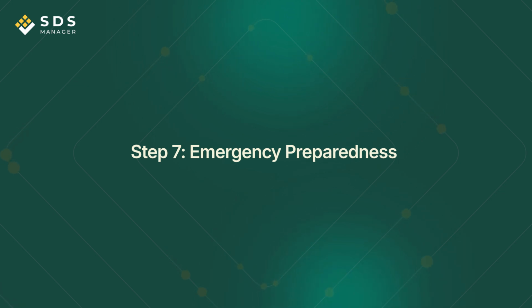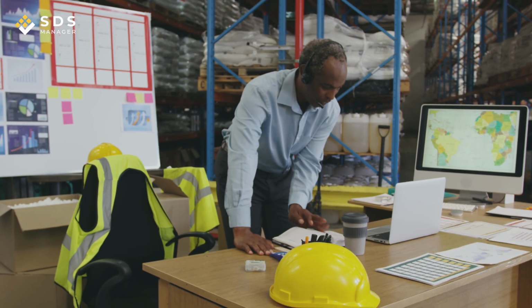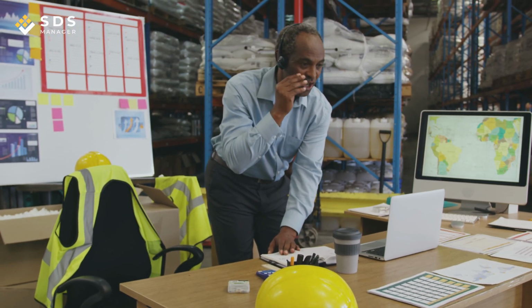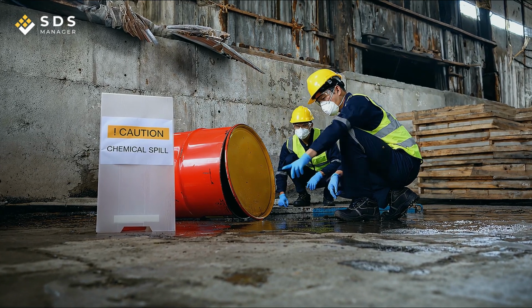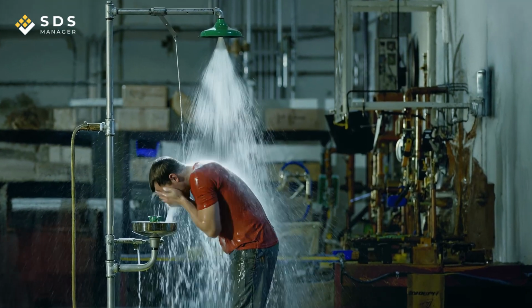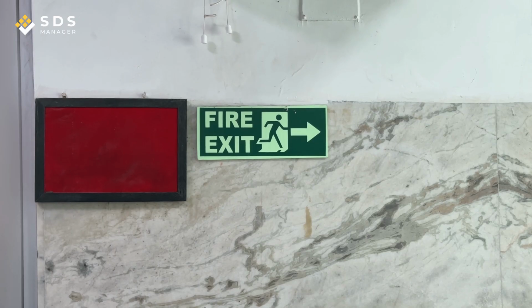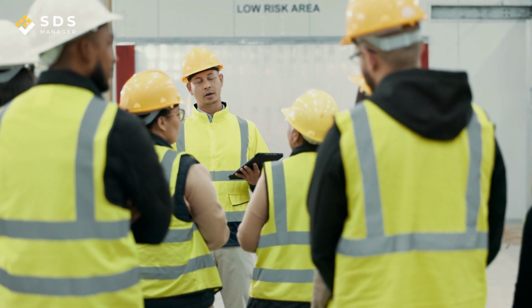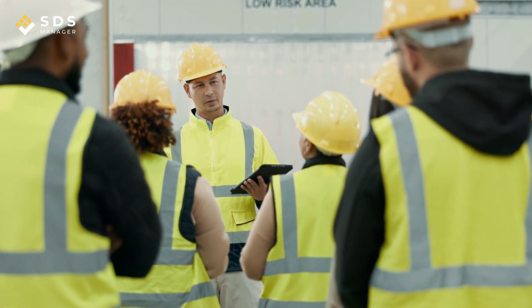Step 7. Emergency preparedness. A thorough job hazard analysis also considers what might happen if something goes wrong. This means evaluating spill response procedures, availability of eye wash stations or emergency showers, first aid readiness, and emergency communication protocols. Preparing for worst-case scenarios reduces the severity of incidents when they occur.